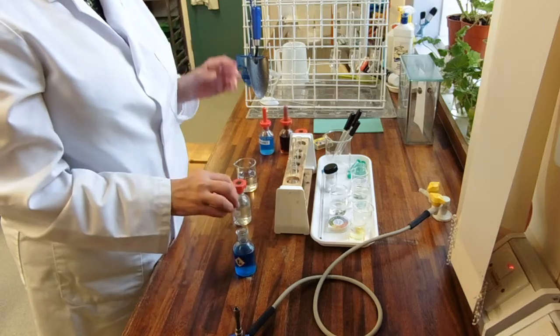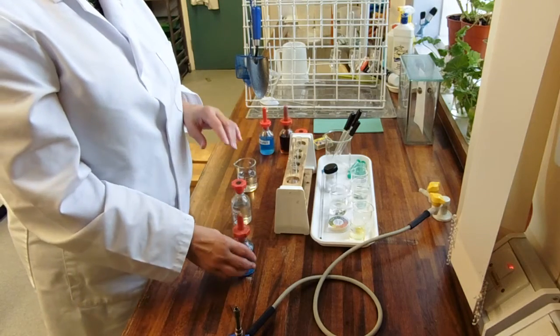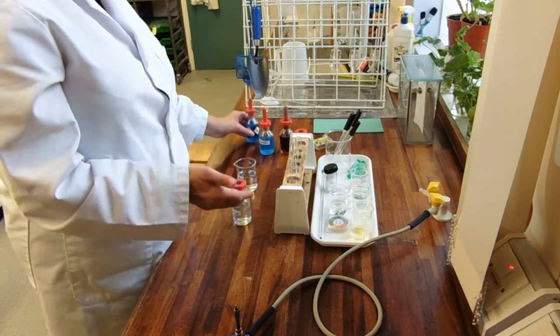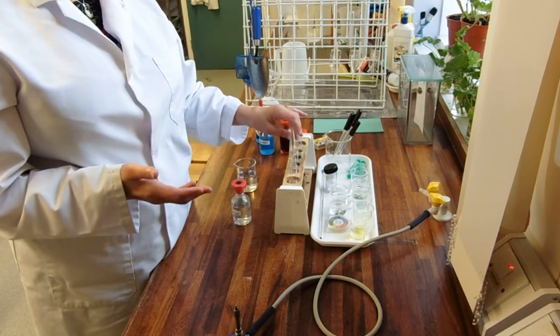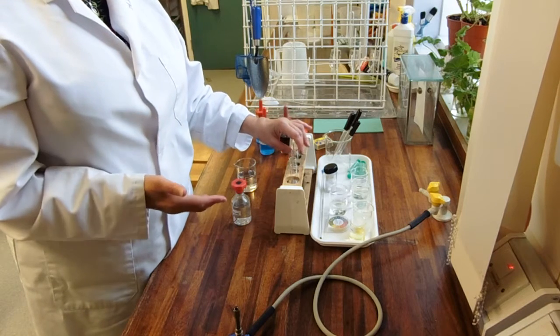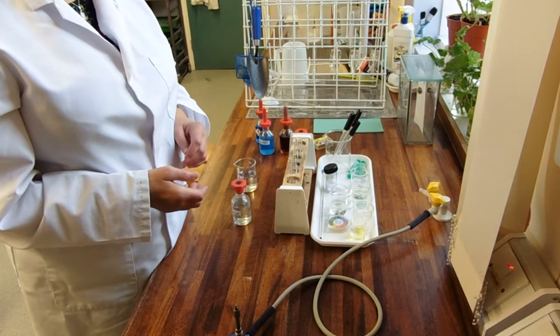Anyway, you get the picture. The key thing is, I think the thing that's most confusing about that test is the need to start with a fresh sample. Because once you've tested it with Benedicts, it's not going to react in the same way. So, you're not going to be able to break it down into its monosaccharide constituents.